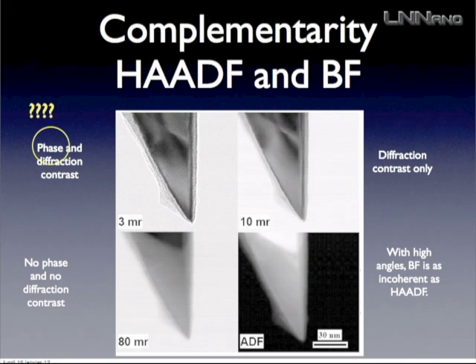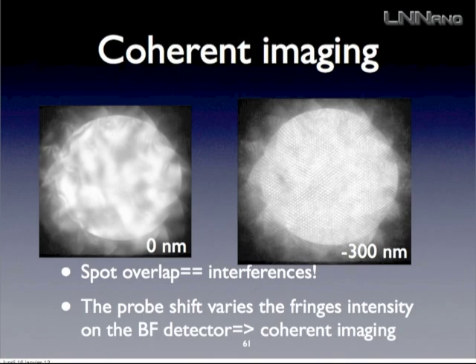And of course, at least I guess, when you had lectures on high resolution TEM, it has been coined as coherent imaging, or maybe someone told you, okay, it's phase. You are measuring the phase of the scattered electron. Like in optics diffraction tutorials, you move your grating, and you will see that the fringes will move on your diffraction plane.